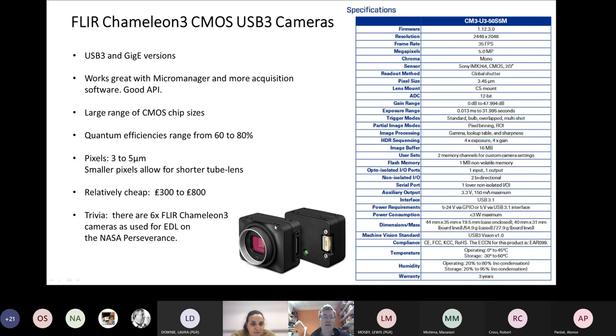And they make these sensors which are absolutely amazing in specification. So you can get a system with a ridiculous number of, can you see the mouse pointer? I've gone to the right. So you can get a 2.5K by 2K chip, respectable frame rates, which you can quadruple quite easily by binning 2x2. And nice, it's not 8, it's a 12-bit system, so quite a good dynamic range.